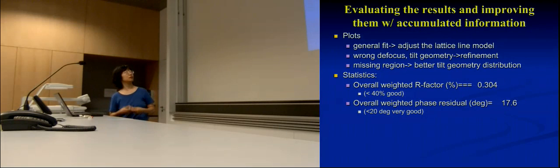And the third thing is, are there any missing regions? If you don't have data, then you're not going to have parameters to put in there for the fitting.